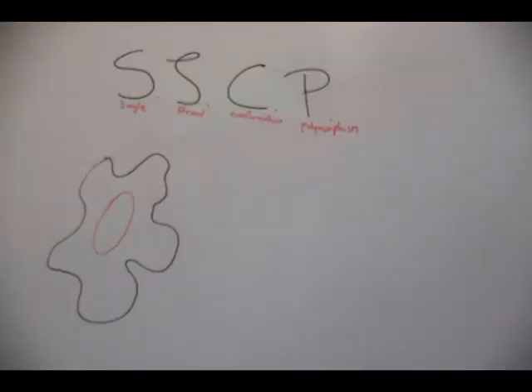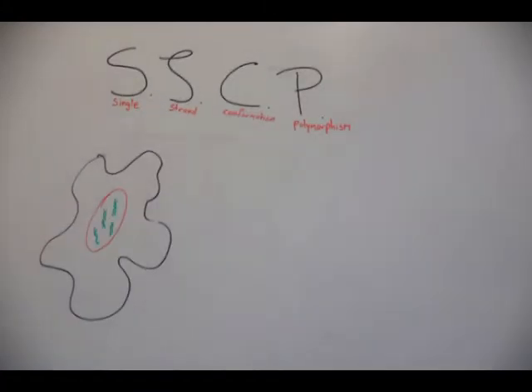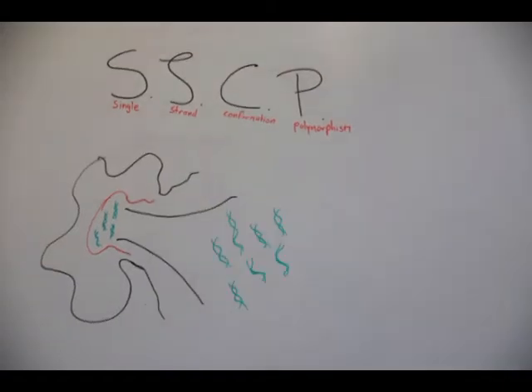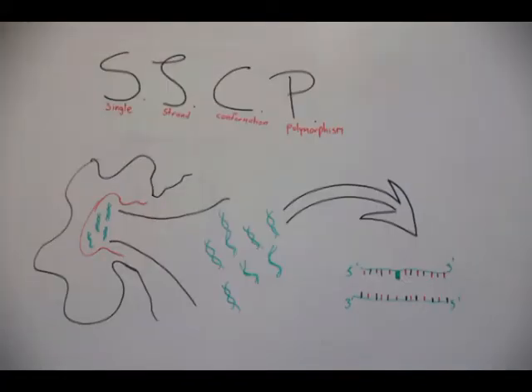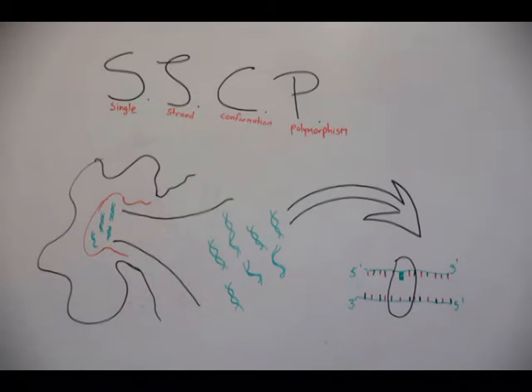First of all, we need to isolate the DNA from the object of interest, which can be a virus, tumor, or genomic DNA of any organism. First, we rip the cell open and isolate the DNA out of all the cell debris. The isolation can be performed in different ways.